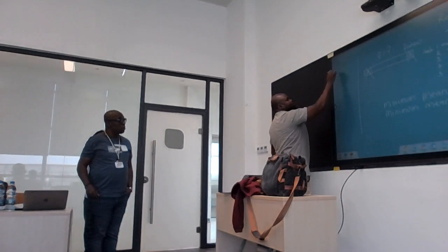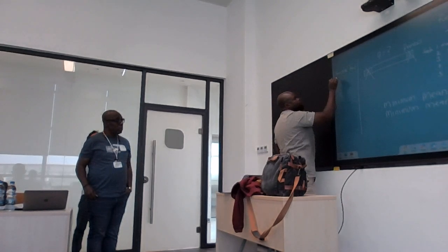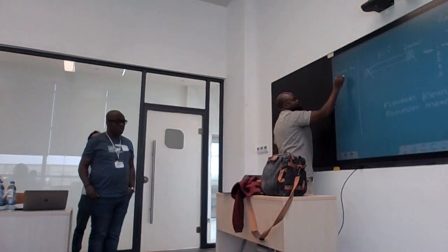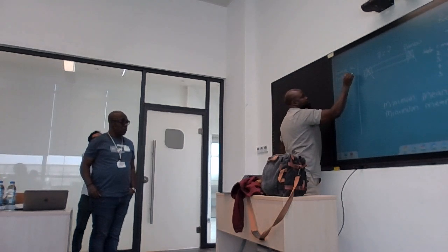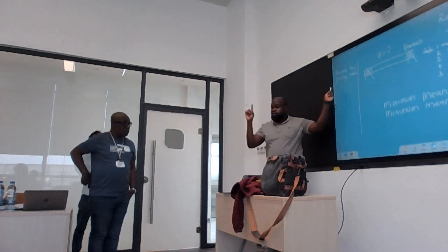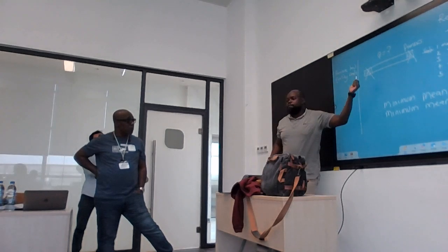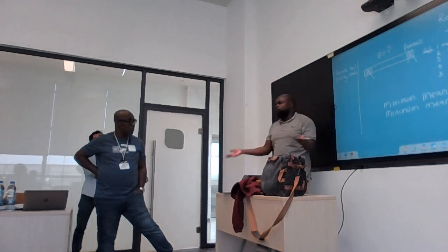So first, remove low quality reads. And we are doing this even before we do anything, right? The reason we are doing this first is because we do not want to waste time with reads that are just of bad quality. There's no reason why you should be removing primers from a read that is already bad quality. Okay? There's nothing that's going to change.